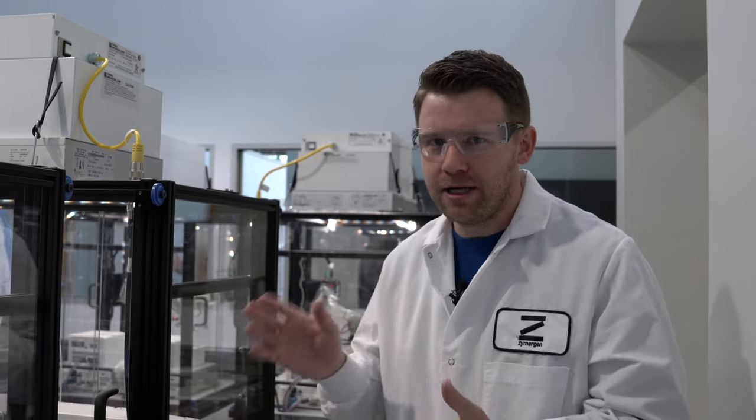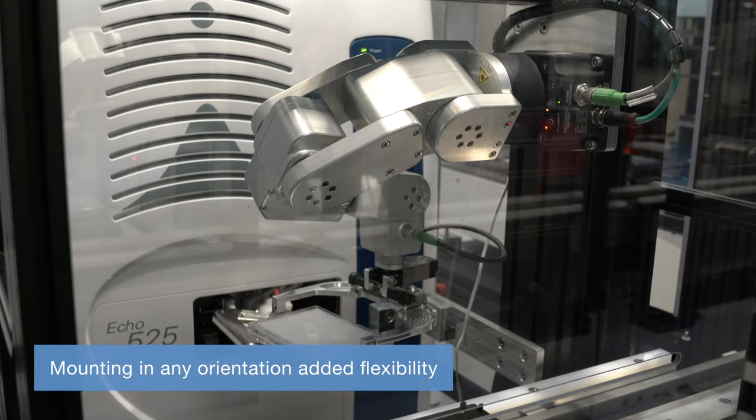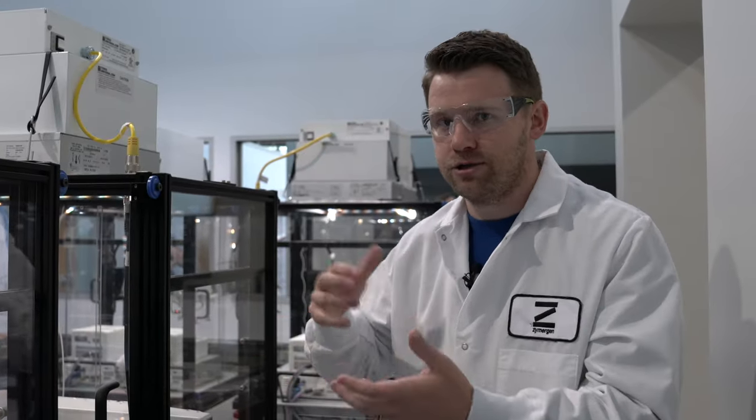One of the things that we really like about the Mecca 500 robots is how easy it is to mount in different orientations. Being able to mount the robot in different orientations is crucial to being able to use this in so many different places.